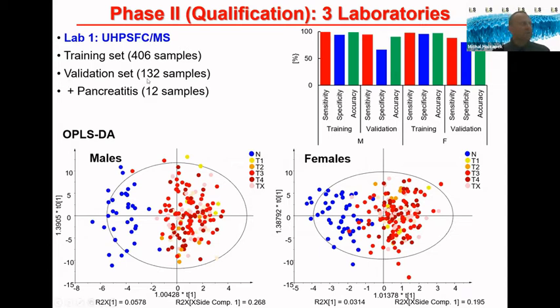So this is the real situation to verify that the method is really useful for unknown samples. You always see this annotation, either training or validation. And in the case of validation, these numbers are always lower, but not by much. So the model is really robust.